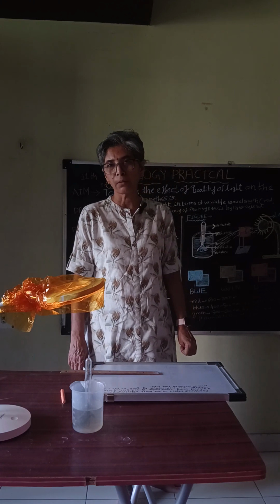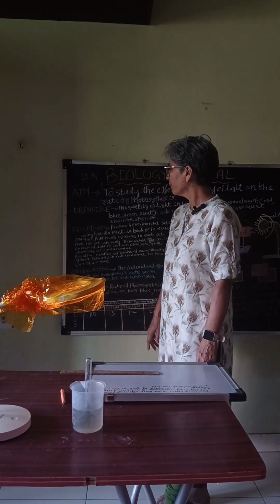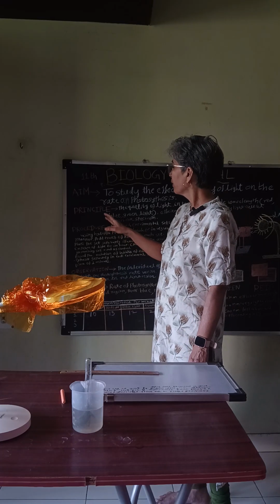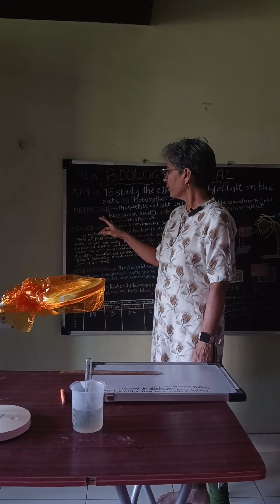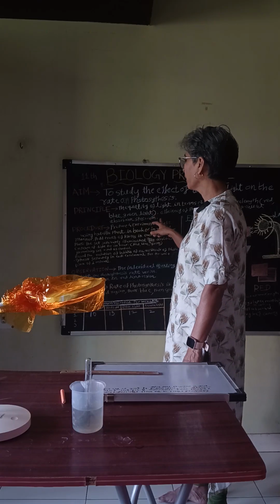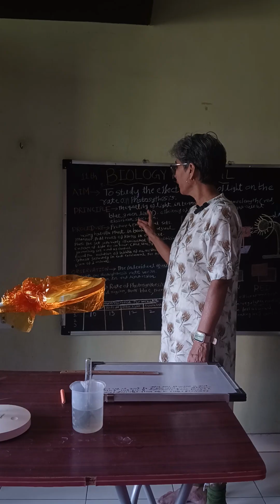These are the requirements for this setup. So in this practical, the principle is absorption spectrum due to blue, green and red light.